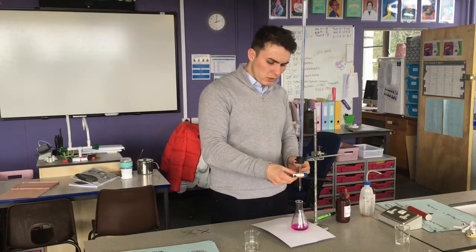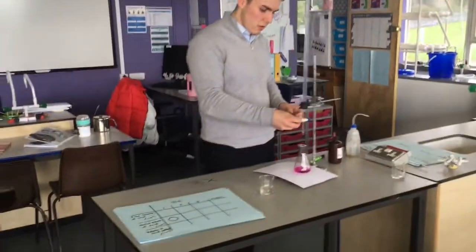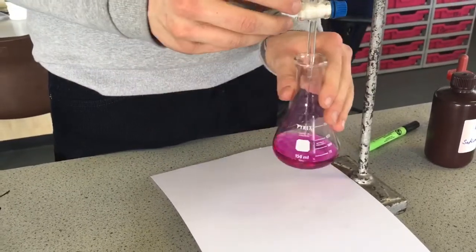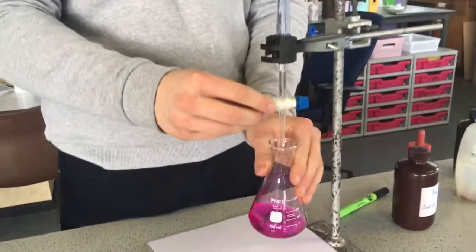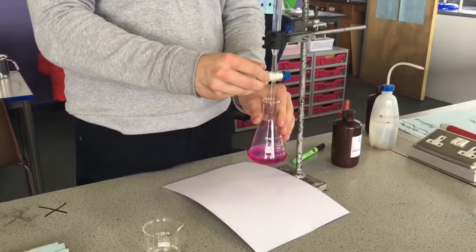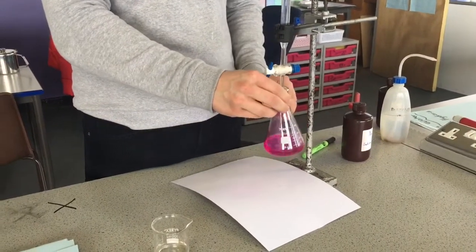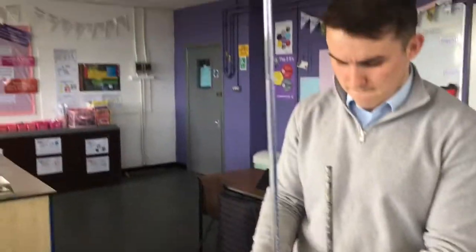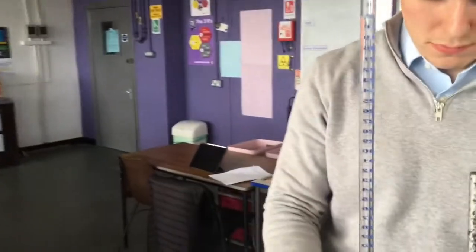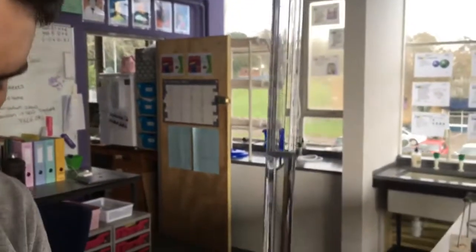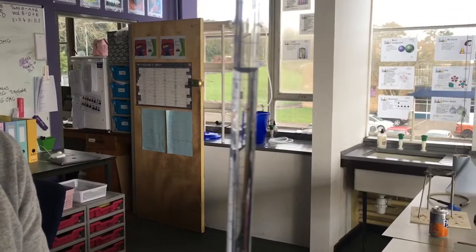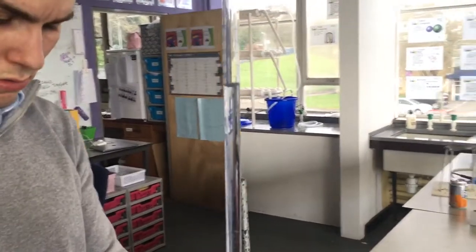I start my titration by simply opening the valve at the bottom. The technique we want is one hand swirling nice and slowly — there's no rush with this. You can even do a trial run to gauge at what point neutralisation is going to happen. When you open the valve, the acid comes down pretty quickly, and a trial run helps you gauge when that neutralisation is going to happen.